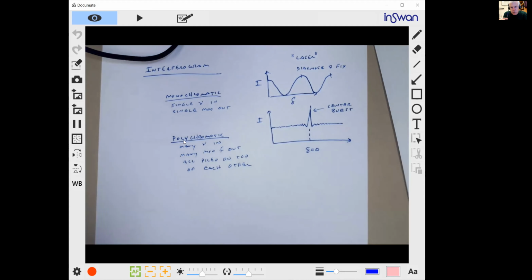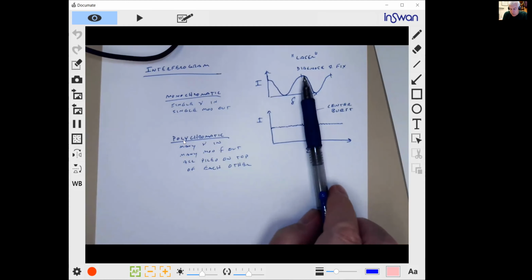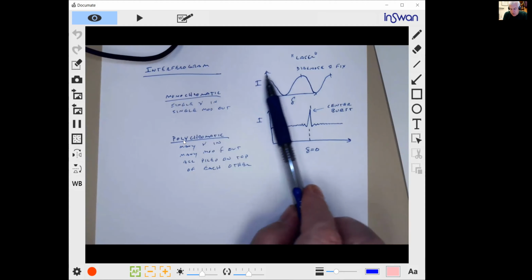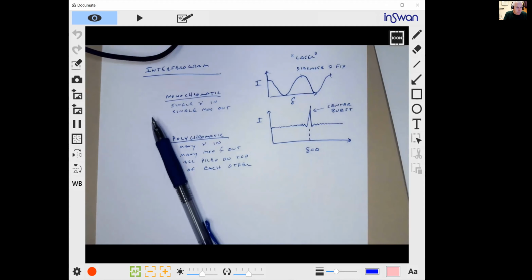So the mirror has to go back and forth, and that's one of the disadvantages of the FT method, is that there literally is a sliding mirror. There's a mirror that travels back and forth. And so that's a little bit of a disadvantage, the mechanical part of it there. But they actually happen to be extremely accurate in terms of frequency, because they lock onto the mirror movement using a laser, right? Using a very consistent frequency laser.